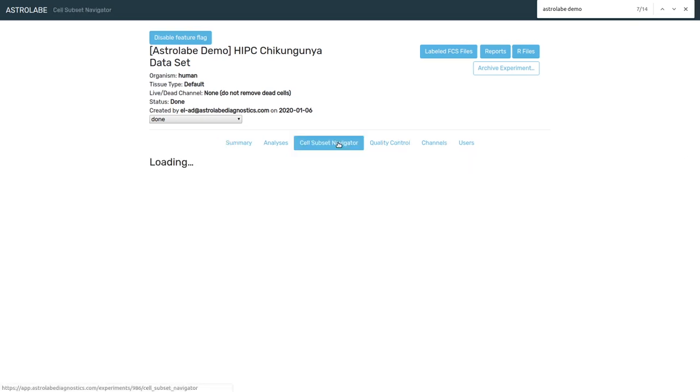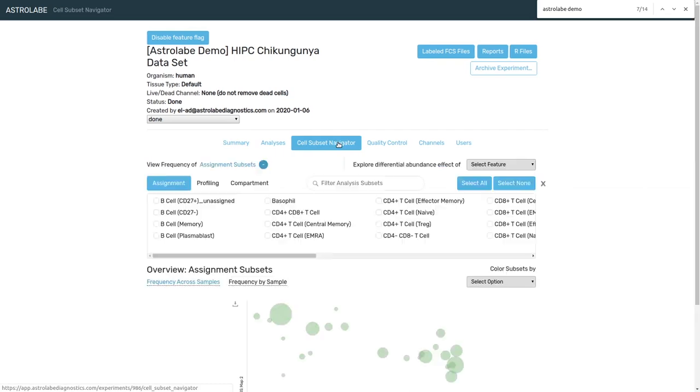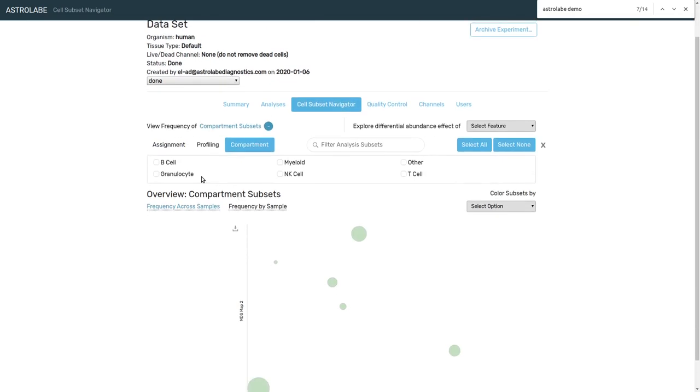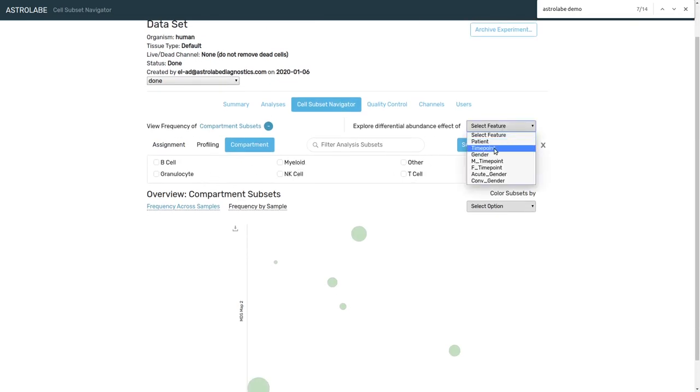Now Astrolabe has already taken care of identifying the different populations of interest. Now it's just a question of taking the frequencies and seeing how they differ across the time points. So I'm going to start by looking at the major compartments, the B cells, the myeloids and so on, and comparing them across the different time points.